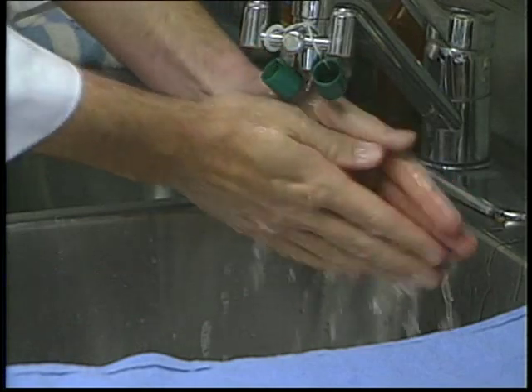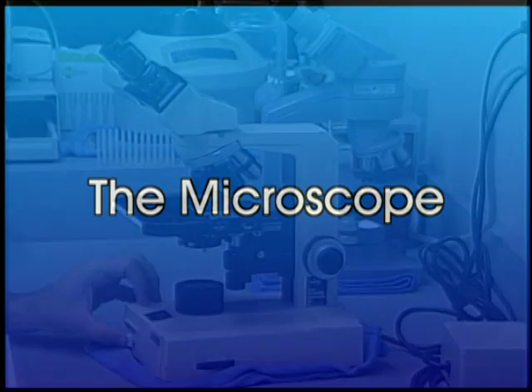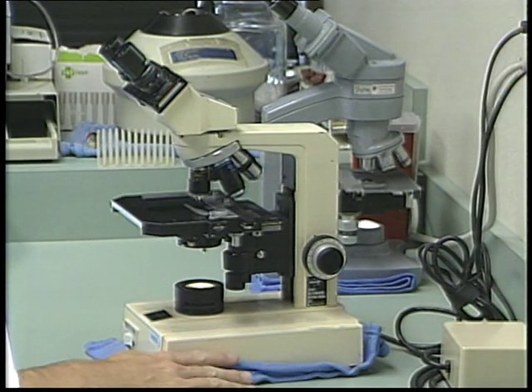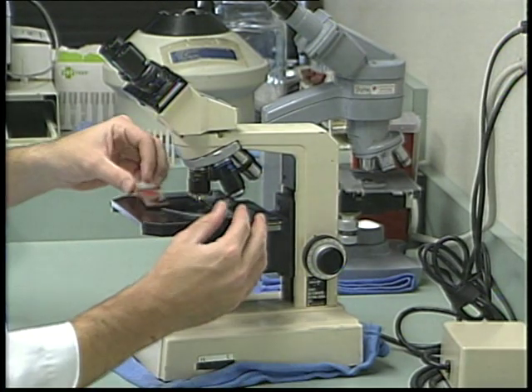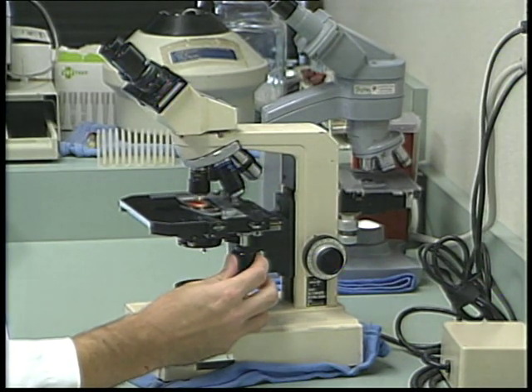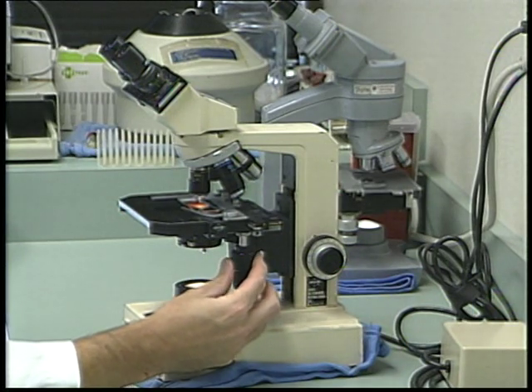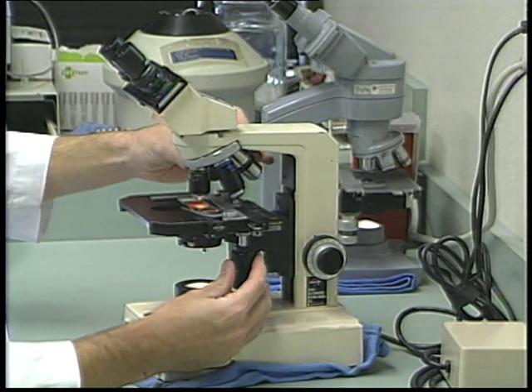You are now ready to examine this slide under a microscope. Before discussing what to look for in identifying parasites, it may be helpful to briefly overview the components of a microscope and how to operate this precision instrument. The light source is turned on and adjusted to whatever brightness level is indicated when looking through the microscope. The stage is the platform on which the microscope slide is secured. The slide can be moved about by adjusting 2 knobs below the stage. One moves the slide horizontally, the other vertically.